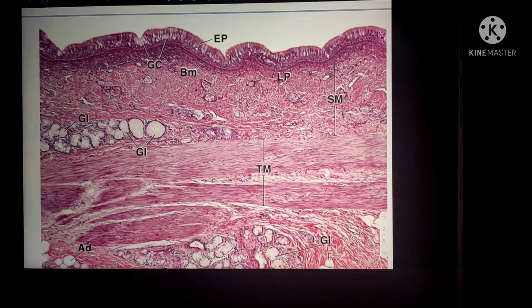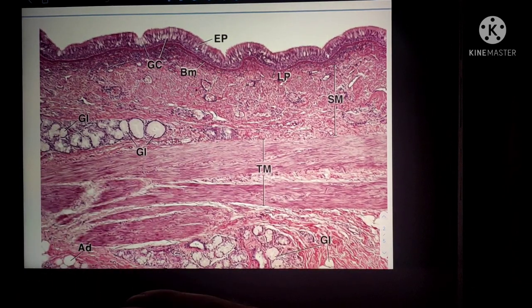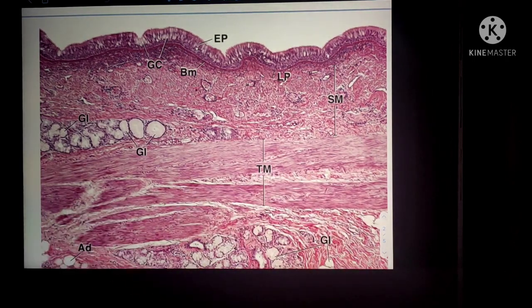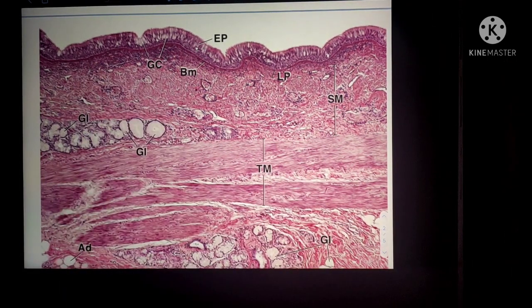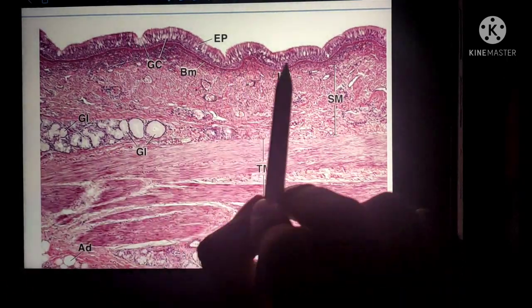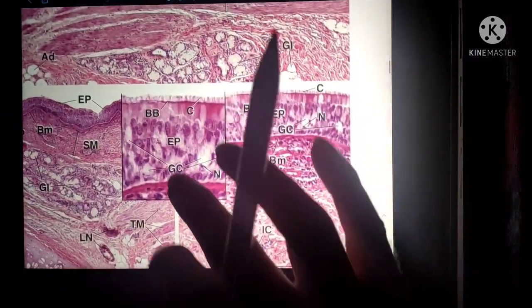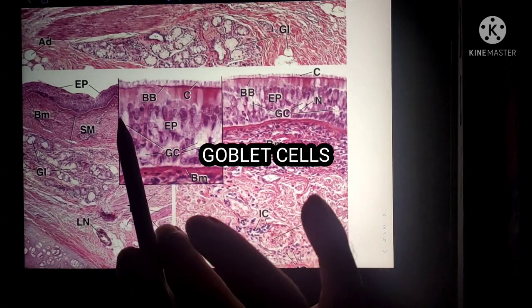So these cilia form the mucociliary escalator system, which expels the harmful dust particles or any other particles that are trapped in the mucus of the airway out of the airway. Thereby it acts as a very important and vital defense mechanism of the airways. Along with the ciliated cells, there are other cells which appear empty in this picture. These are the goblet cells.